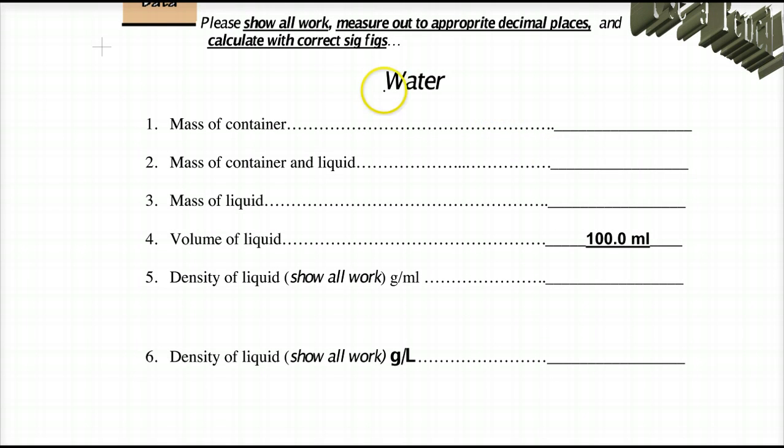Water, you're going to get it from the tap, and be very careful turning the water on in the sinks in the back. They're under a spigot that will produce high pressure for aspirators for AP Chem. So taking the water out of them, just go very slow, okay? That's the way we're going to get the water.